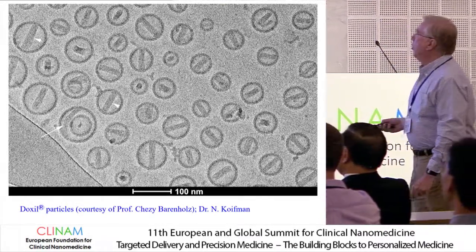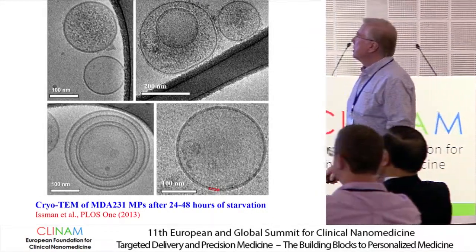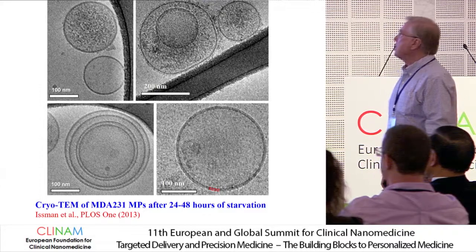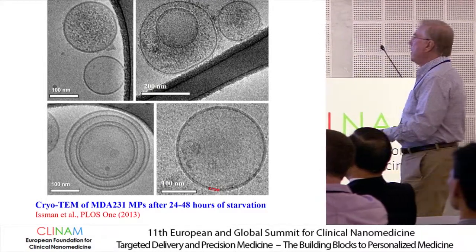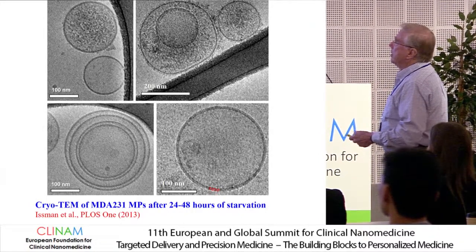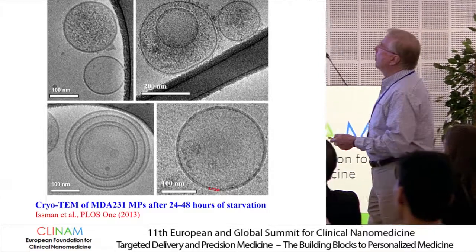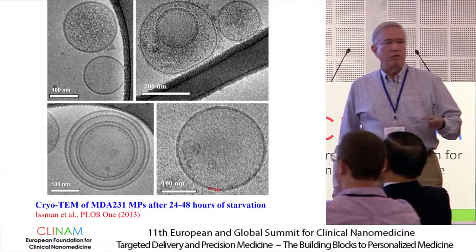All right, so finally, with all this nice technique, let's go and see what we can get. These are extracellular vesicles, and this was our first paper on the project some 5 years ago. What is very interesting here is that, as was said in the first talk, the extracellular vesicles are very, very different from each other.